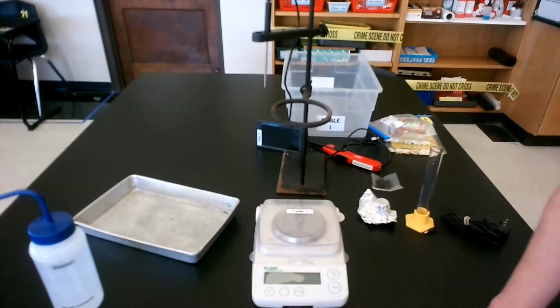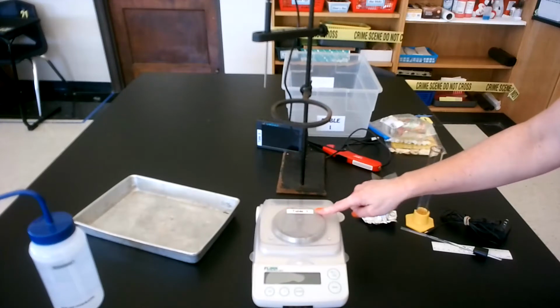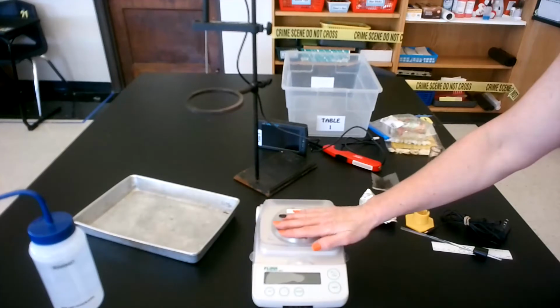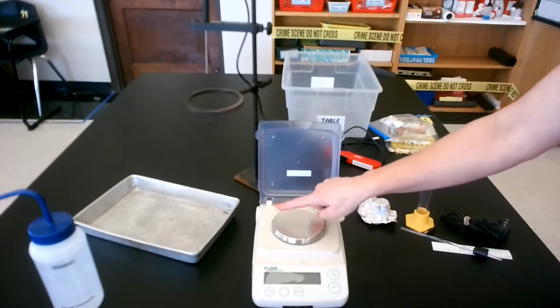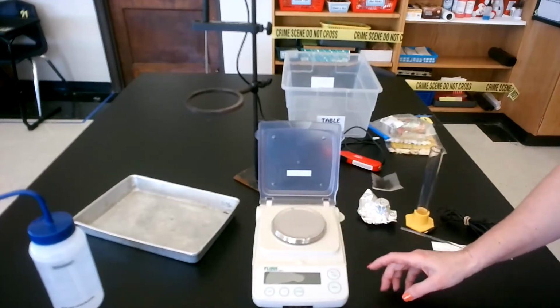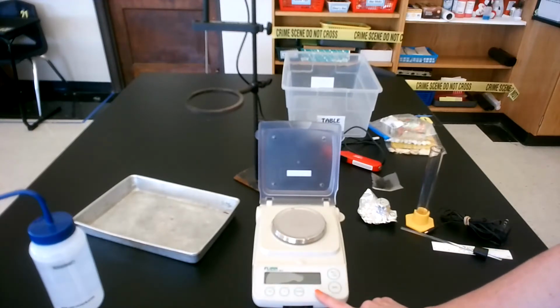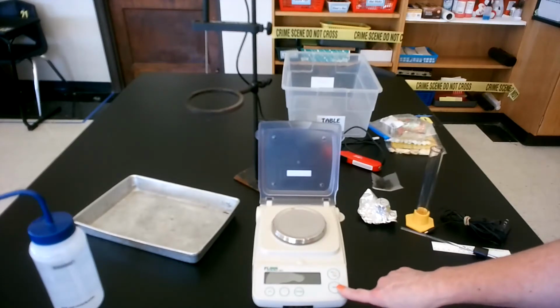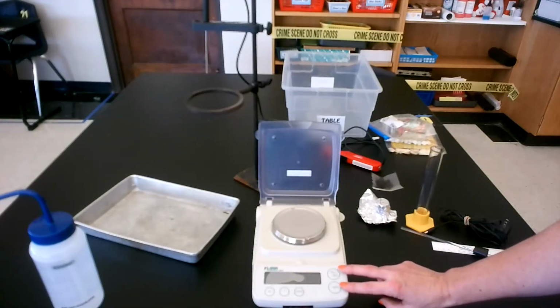So let's go ahead and talk about the electronic balance. Each table will have a table number on it that you're responsible for your electronic balance. There is a cover on top that protects it. So I'm just going to open the cover, and then I'll have my metal weighing surface. What I need to do is turn this on. There are a lot more buttons than what we've seen on the triple beam balance. So we have on/off, and instead of just pushing the off button, we have a tare or a zero button. We're not going to worry about these other three buttons. These are just the two you need to focus on.